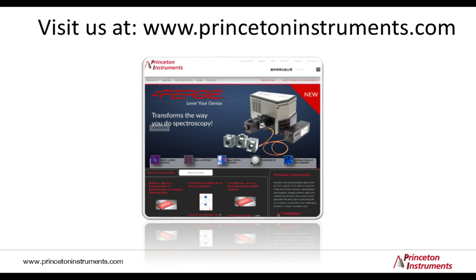And the final question is a quick one. Is there any fundamental difference between a spectrograph and a spectrometer? That is a good question. I typically use the terms interchangeably. It might be a very technical thing, however it might be important.